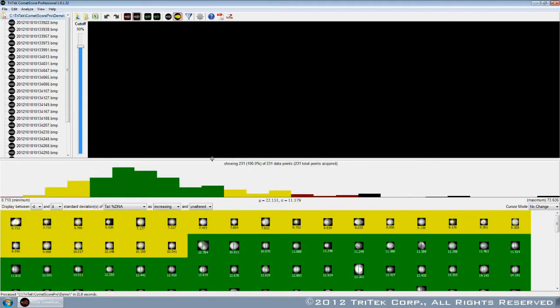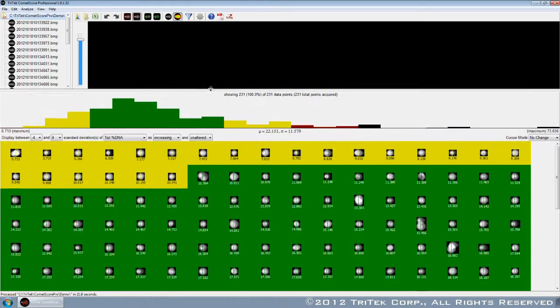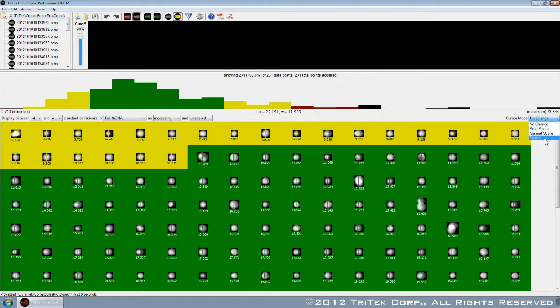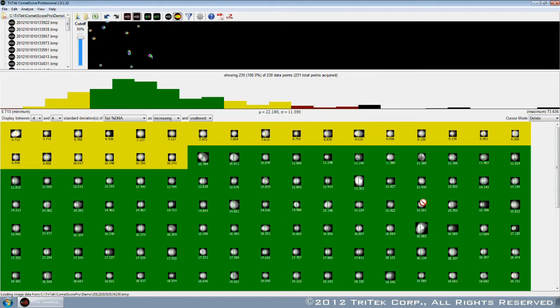After scoring, the cell data are instantly translated into distribution histograms that reflect 18 different statistical measurements. Each comet is color-coded to indicate its relationship to the mean.